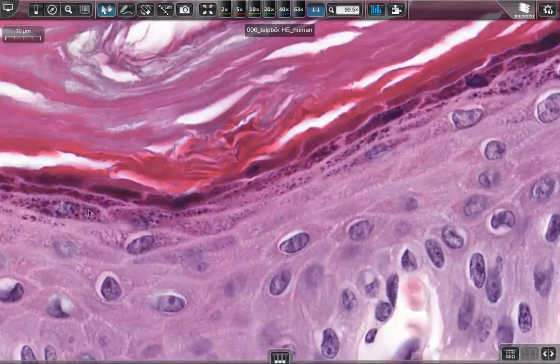And then here we have the granule-accumulating cells. That's the stratum granulosum, representing keratohyalin granules. Over the stratum granulosum, there is a homogeneous red area. This is the first layer having no living cells, just compressed dead cells.